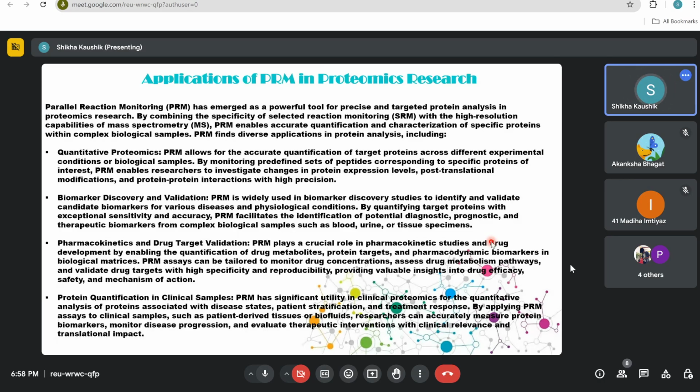technique in your clinical sample, because PRM ऐसे clinical sample में ज़्यादा easy to maintain होता है, because you have already selected your pool of proteins that you want to study, and now you just have to apply the same set of proteins to all your clinical samples.